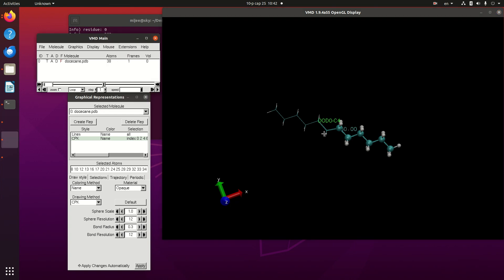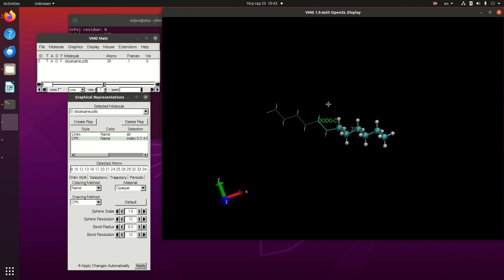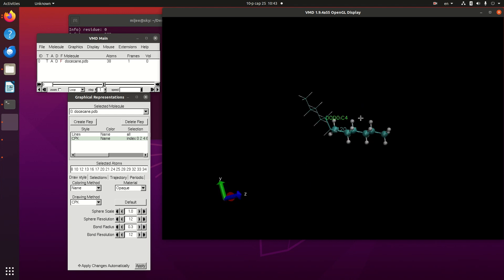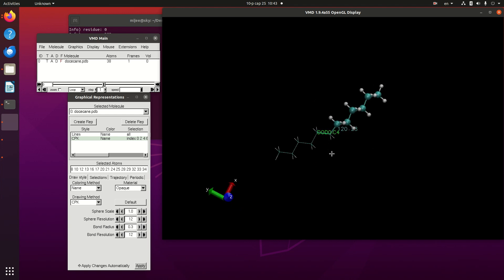Click on the rotating angle. And maybe we have 120 degrees of dihedral angle.